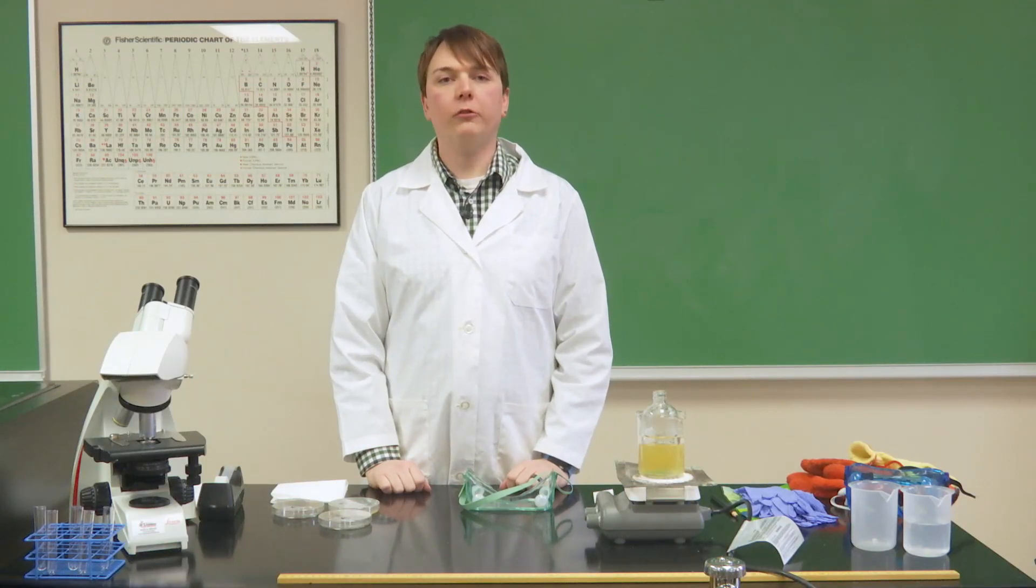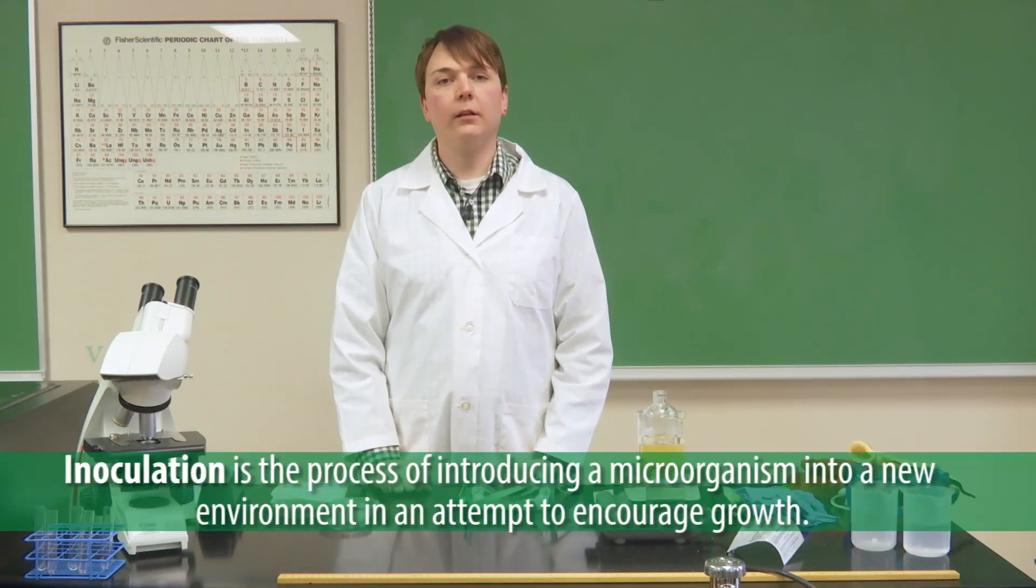In this quick video, I'm going to demonstrate how to prepare your media and inoculate it in order to grow a bacterial culture.